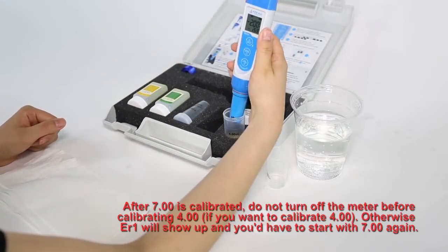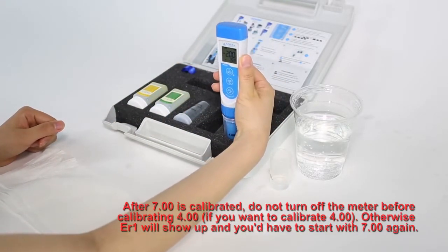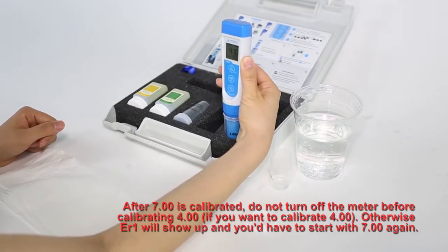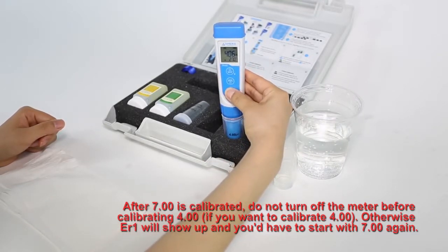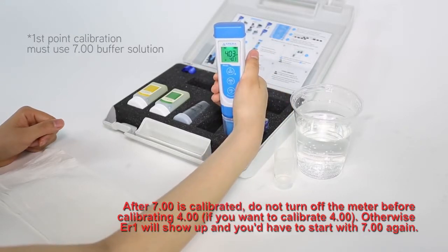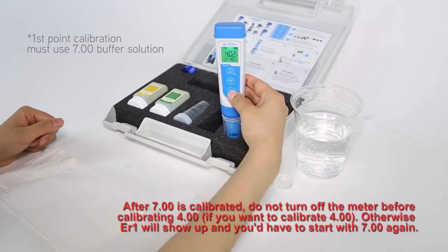For second point calibration, dip into 4.00 calibration solution and follow the same steps that you used in first point calibration. Please note that first point calibration must use 7.00 calibration solution.